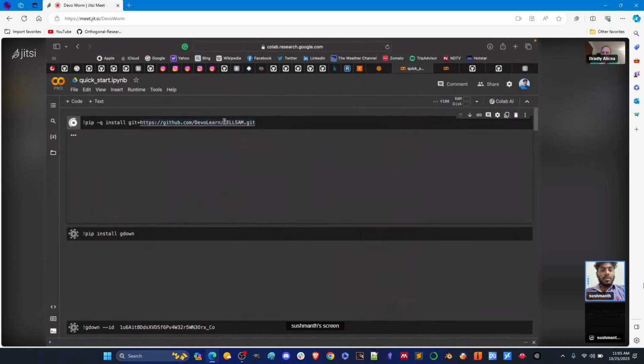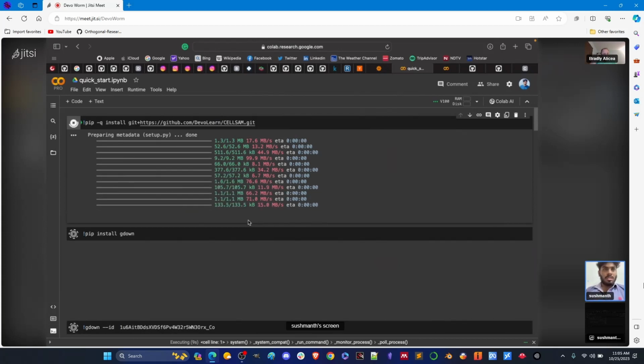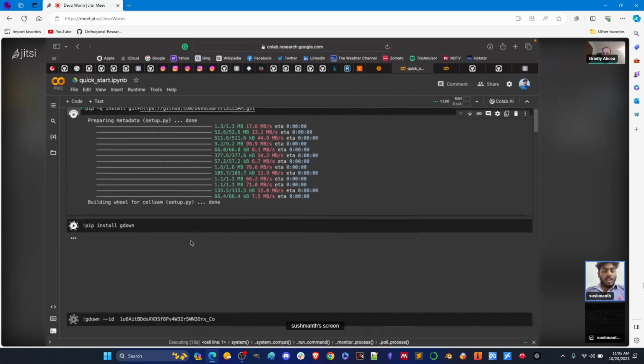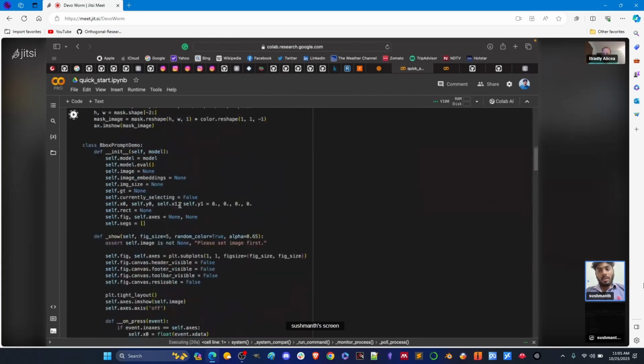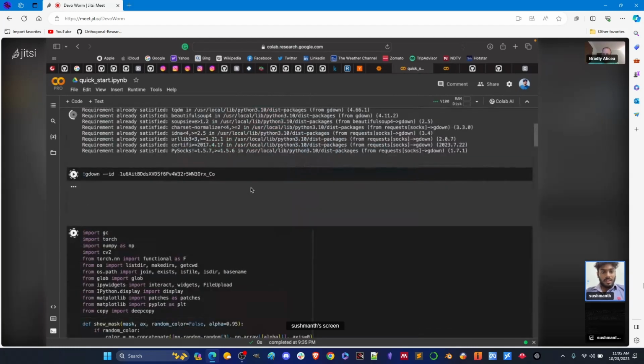While fine-tuning it, I required a lot of GPUs. Luckily, I got them through credits, and it didn't cost me much, around a couple of bucks, thanks to my student ID and so on. So here is the model. I'll show you an example with a bounding box prompt and the point prompt. These files are running, just a minute.